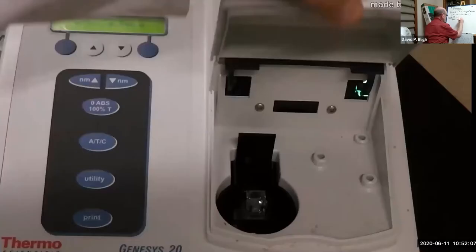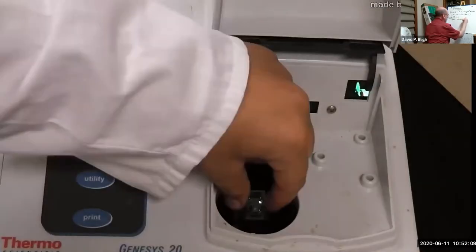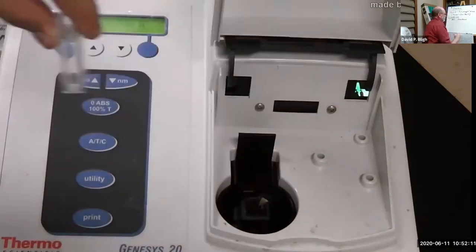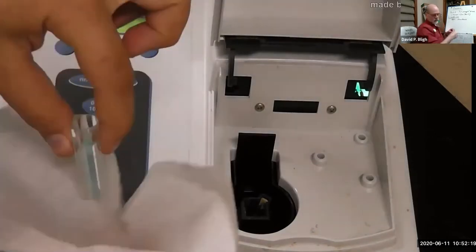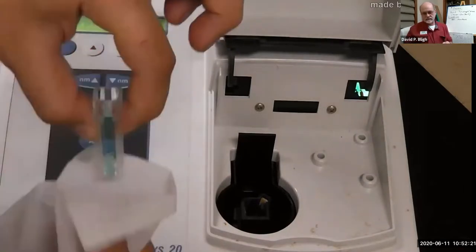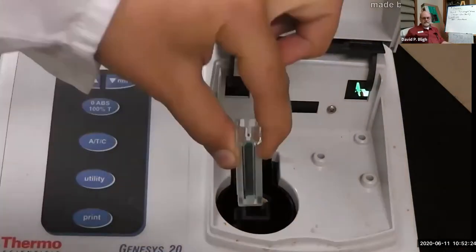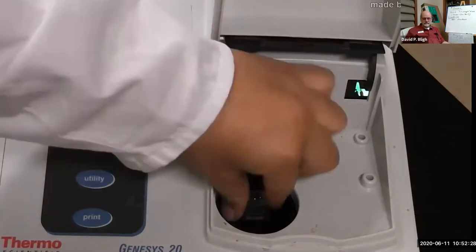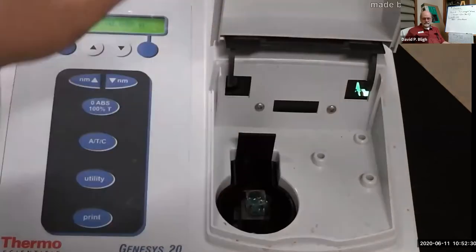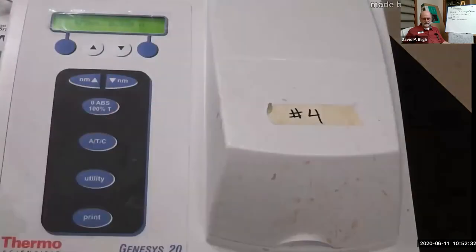Without adjusting any settings, simply take out your blank, holding the opaque side of course, and insert your cuvette with the solution of which you'd like to take the absorbance. Make sure that you take a Kim wipe and wipe the transparent sides of the cuvette to make sure that there are no smudges or drops of solution on the side. And again, place it in the machine, facing the correct way, and close the door.